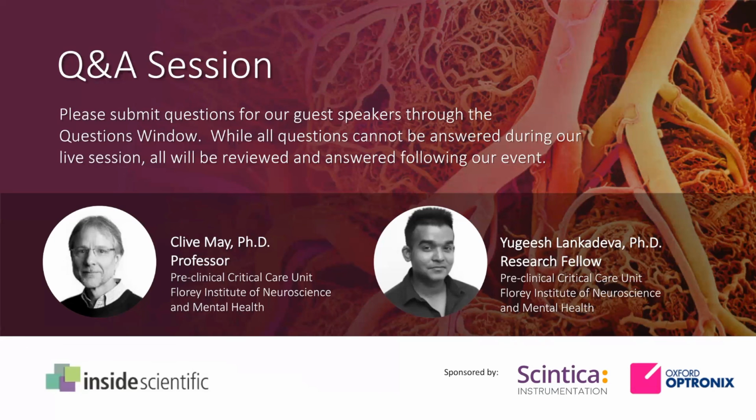I think it's important to understand that the value of bladder urinary PO2 we get is not an absolute value of medullary tissue PO2, but what we are rather suggesting is that the pattern of change between these two variables are quite similar, not only in the healthy state, but also during development of acute kidney injury and also following resuscitation with commonly used clinical vasopressors.